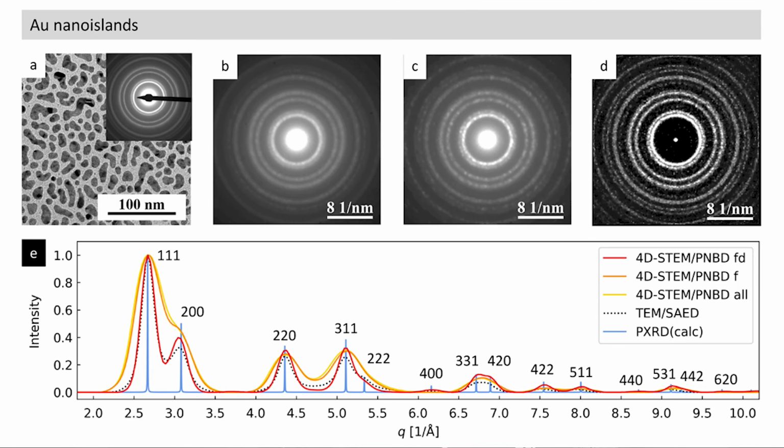Now, I know we have also prepared some concrete results, because you have tested 6 different nanocrystal types. Their names I cannot even pronounce. However, what do we see here, Mirek? Okay, so the first example are gold nanoislands. Gold nanoislands are small nanocrystals with very high diffracting power, and what we see here is the direct summation of all those nanobeam diffraction patterns. In this case, we see that even without any mathematical processing, we can see quite nice diffraction rings.